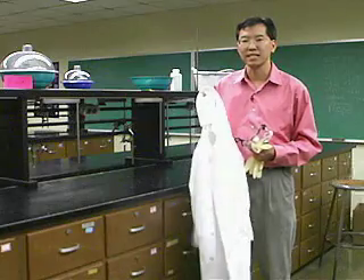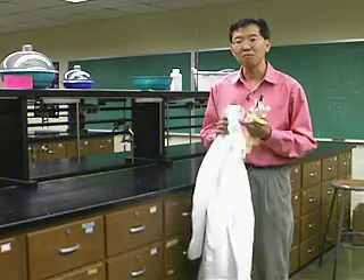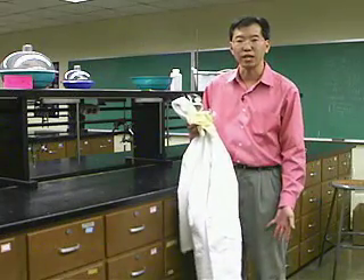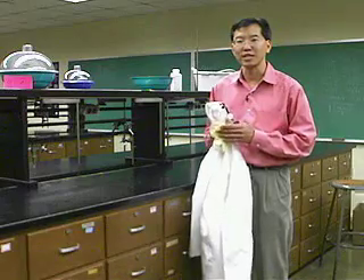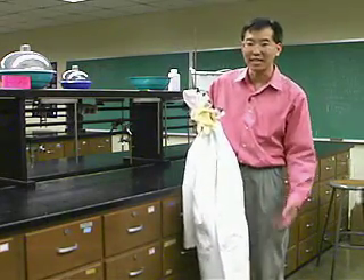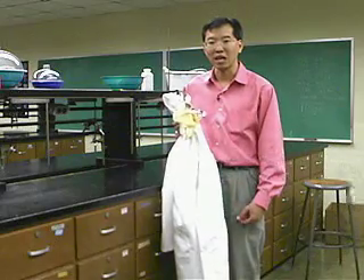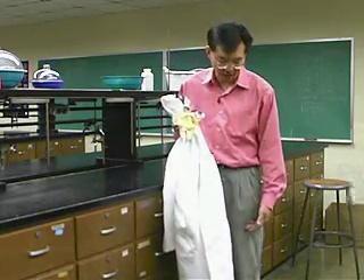Something else you might consider investing in is a lab coat if you want to protect your clothes — that's a good idea. And probably you're not allowed to wear short pants; you should wear long pants and shoes, not sandals or go barefoot. That's for your protection because if you spill something on your bare leg, your skin is being attacked by whatever you spilled on it. If it's your pants, you might have a few seconds to get over to rinse that compound off of your leg.